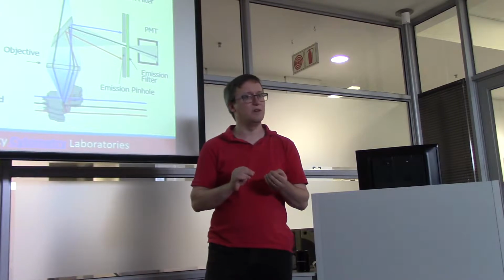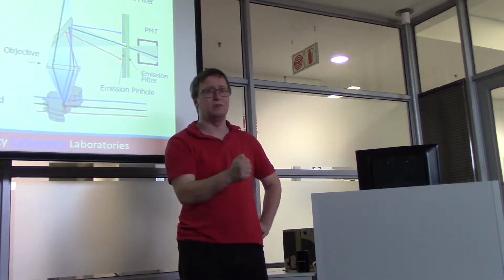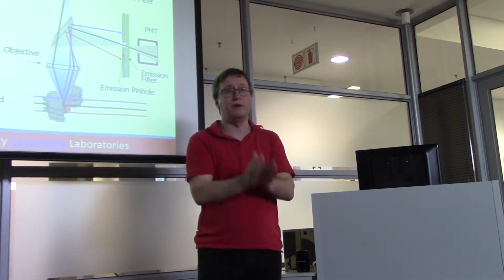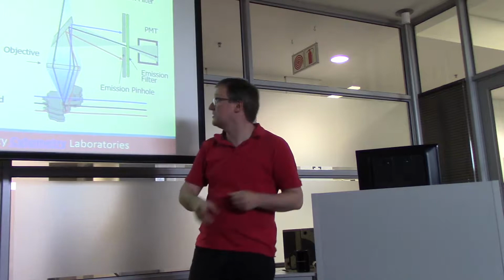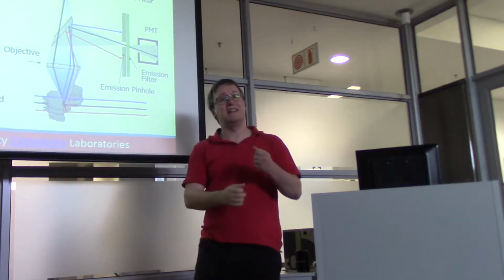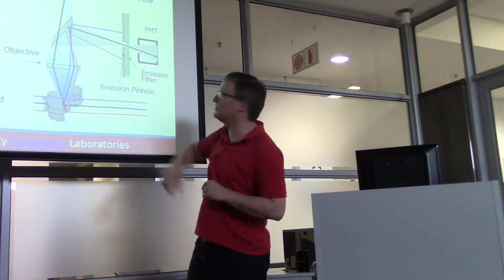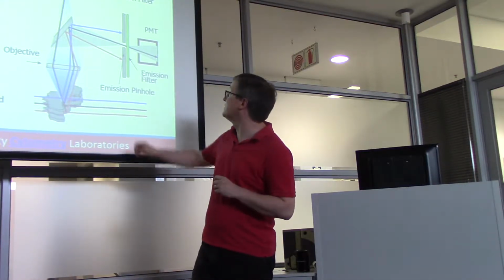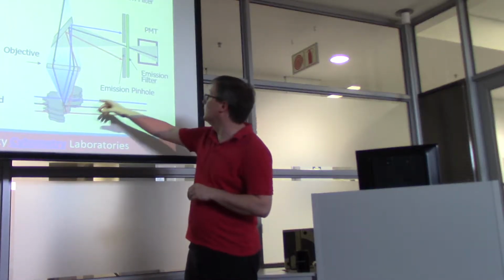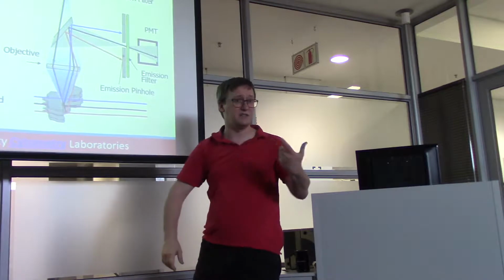This all gets turned on its head a little bit as we go to fluorescence microscopy instead. So in this case, we have light that is rather special. We're using laser light to light the sample. That laser light is different from visible light in that it's monochromatic, it's one frequency, and it's polarized. So this laser will pass through the various lenses to get to the sample. That light is taken up by fluorescent dyes. They become excited and they emit light, and that light is emitted and passed out to a PMT, a photomultiplier tube. So instead of having a lamp serve as your light source, you need a laser because you're trying to emit particular frequencies. You have dyes in the sample that are able to emit light in response to that laser, and you're not detecting by eye, you're detecting by a PMT.